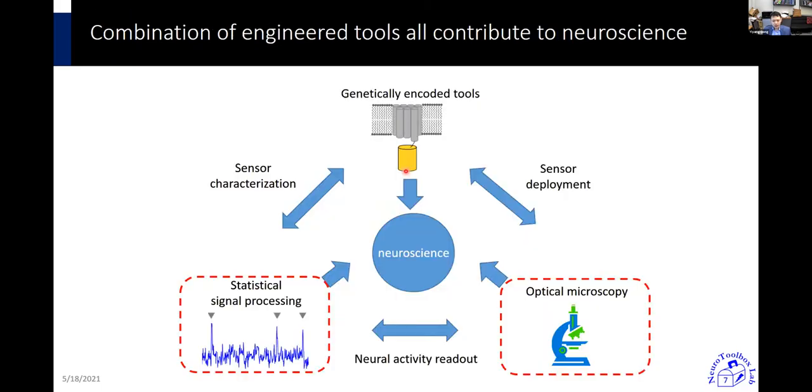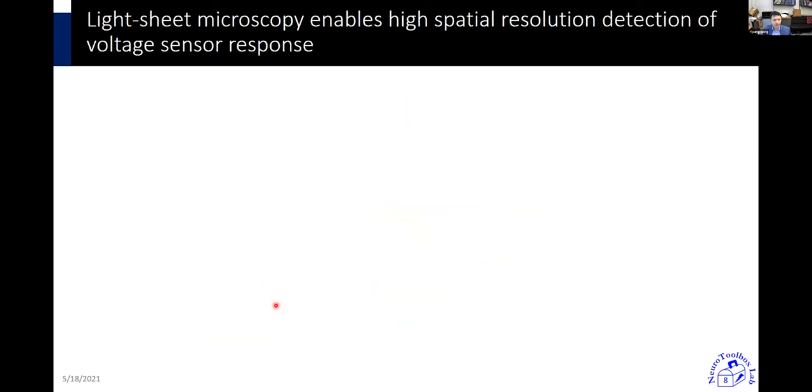All right, so my lab works on the amalgamation of these areas, and today I'm going to talk about optical microscopy in this field and signal processing in this field. So we'll start with optical microscopy.